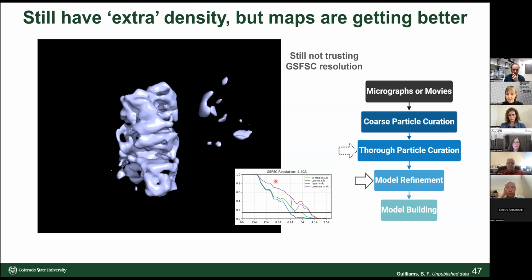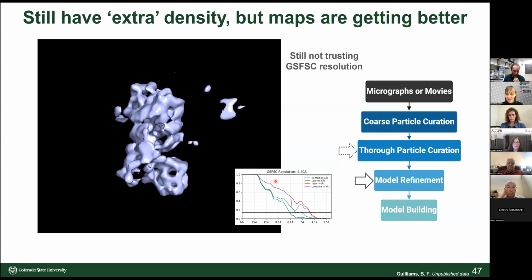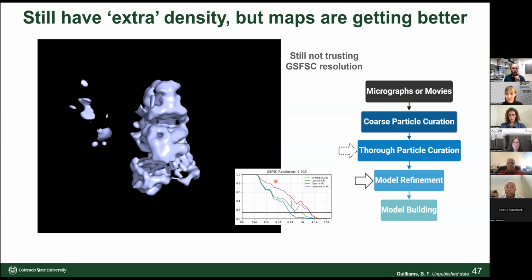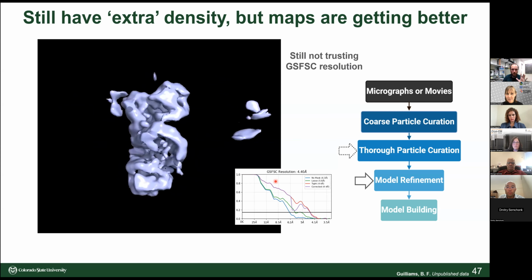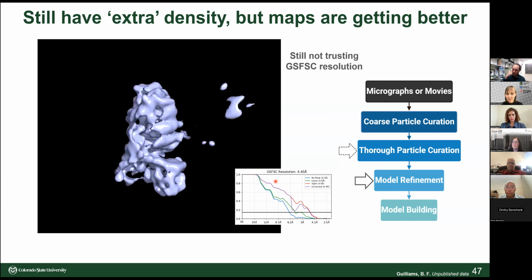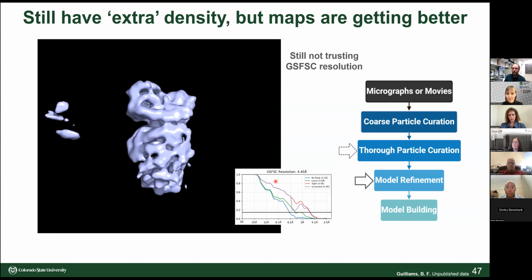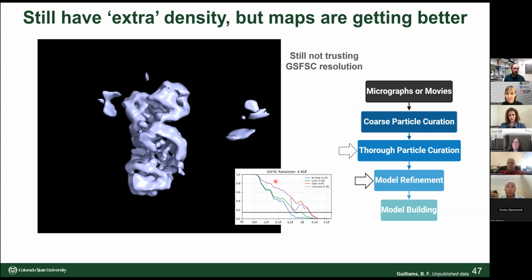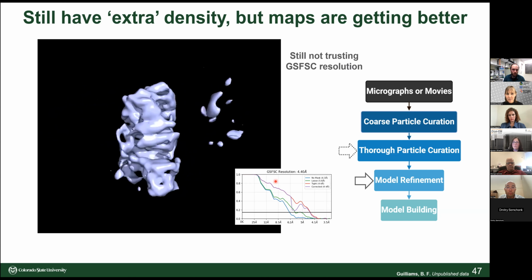As for a shadow, not really. Not that we've observed this being a limitation thus far. Selenium is in the TEM actually not that electron dense compared to something like gold.